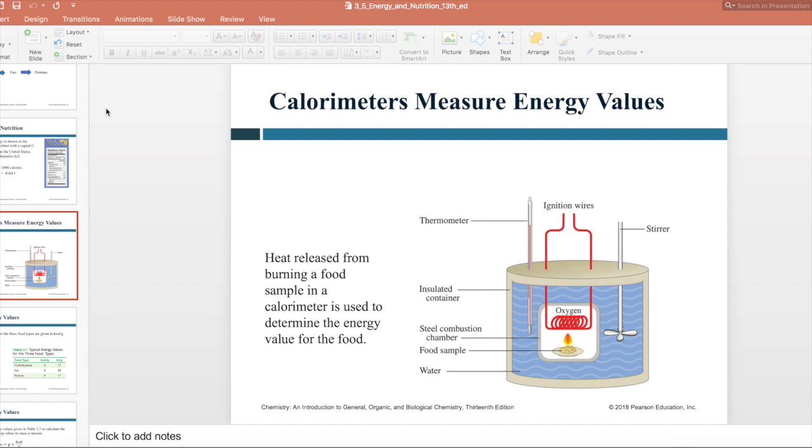Now, what is calorimetry? As you may see, the word calor in there means something to do with heat, right? So calorimetry is any experiment designed to measure the transfer of heat. The basic premise of a calorimeter is that whatever heat transfer is occurring, whether from food, from a hot piece of metal as we'll be doing in today's experiment, or from ice, something colder, not hotter, whatever that transfer of heat results in, it will change the temperature of the water.